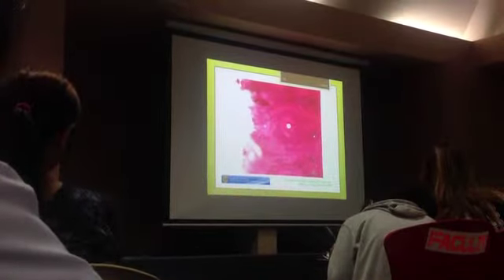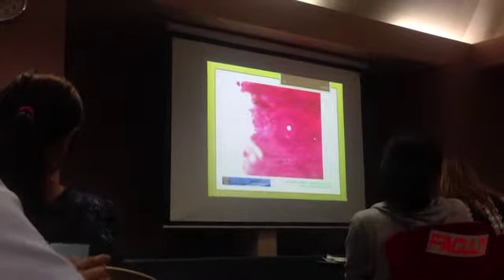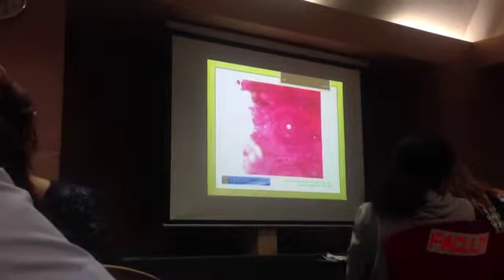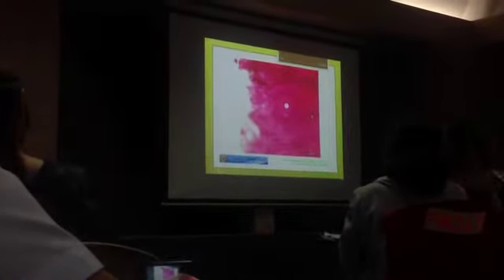Histological classification. You can classify this tissue grossly and histologically. So, histologically, how do you classify this tissue?